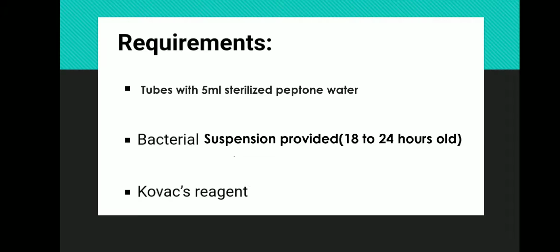Requirements: tubes with 5 ml sterilized peptone water, bacterial suspension provided which is 18 to 24 hours old, Kovacs reagent.